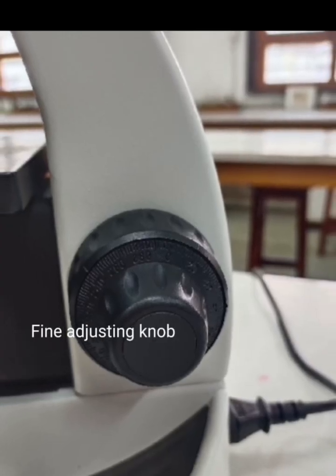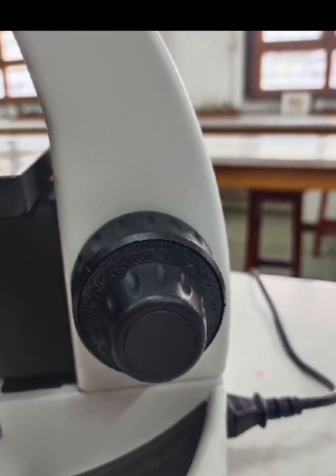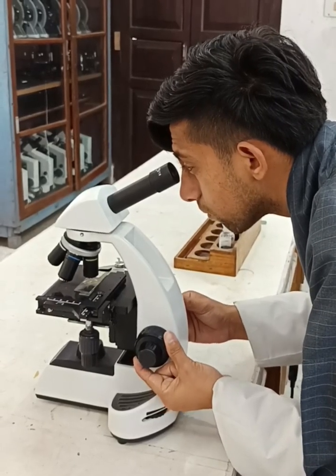This is fine adjusting knob. This knob is inside the coarse adjustment knob and is used to bring the specimen into sharp focus and make the view of the image clear and better.